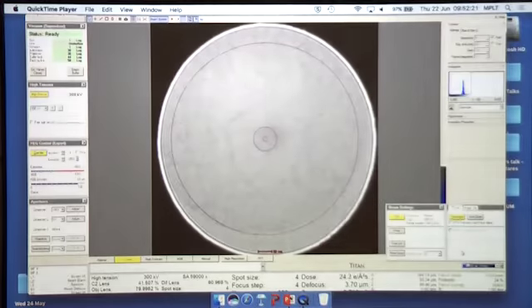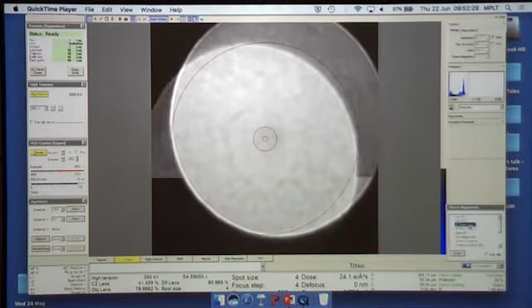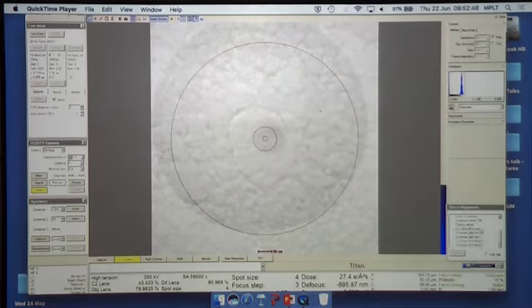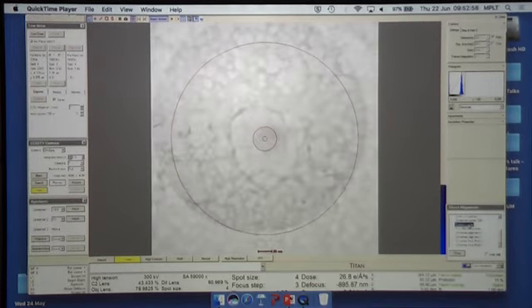So in TEM mode, same thing again. Go to direct alignments. We've already focused. We do the beam shift, then the pivot points. Actually here they were quite bad. So bring those two spots together. Do the same for pivot point Y. Good. And now the rotation center. So it was quite bad here. You can see the middle is shaking quite badly. So we just adjust multifunction X and Y here until the image stops wobbling.